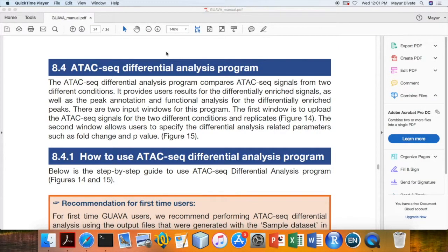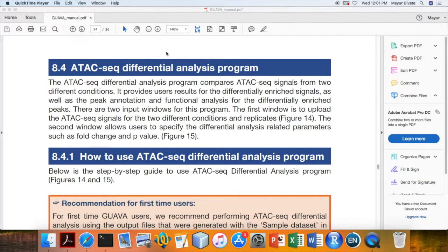Hello everyone, in this tutorial I am going to show you how to use GUAVA ATAC-seq Differential Analysis program.